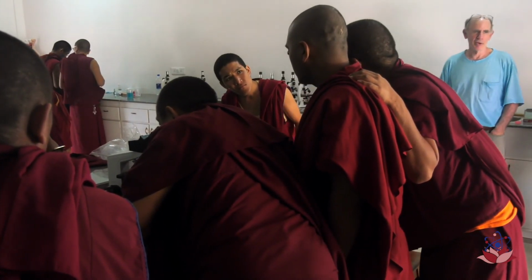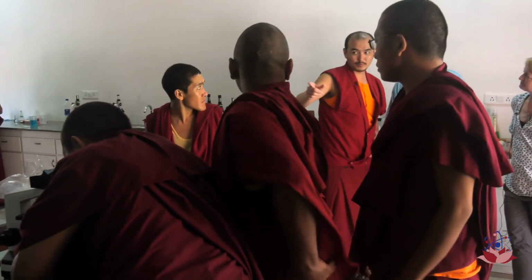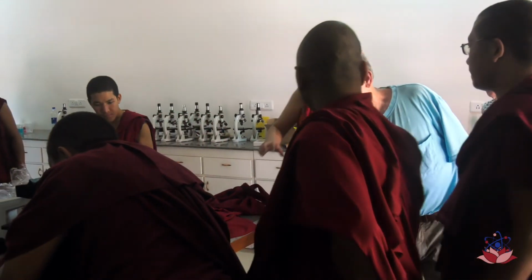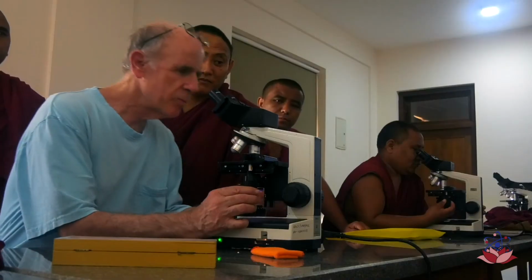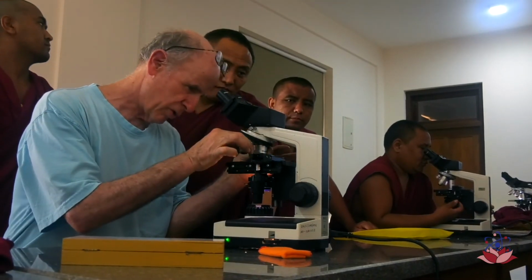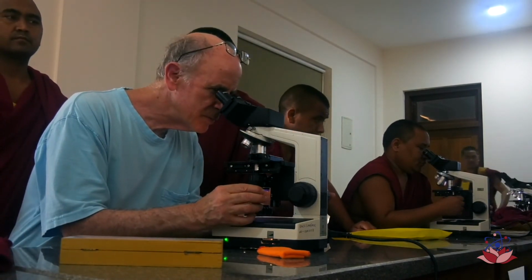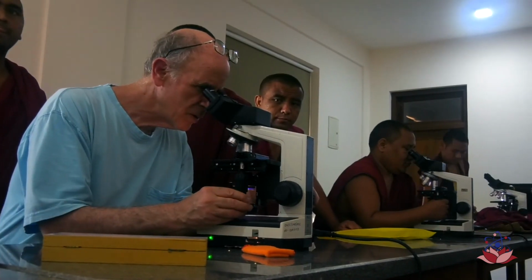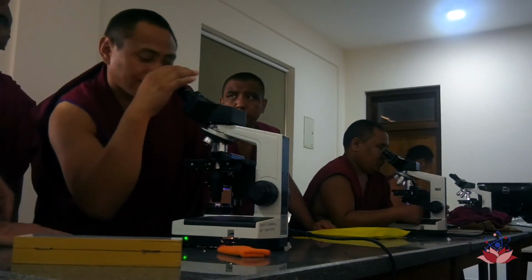So on this slide, the blue one is white blood cell, and the others are red blood cells, right? That sounds right. I didn't see the blue one. Yeah. Those are white blood cells.